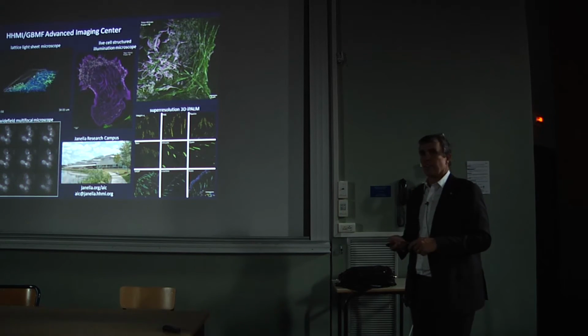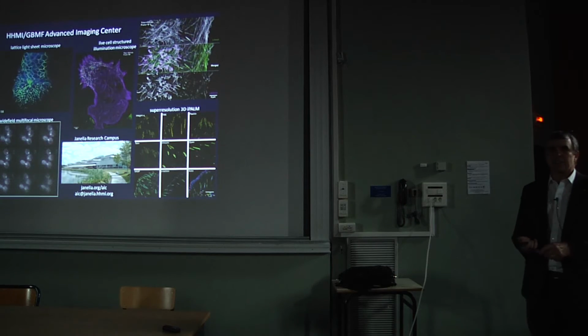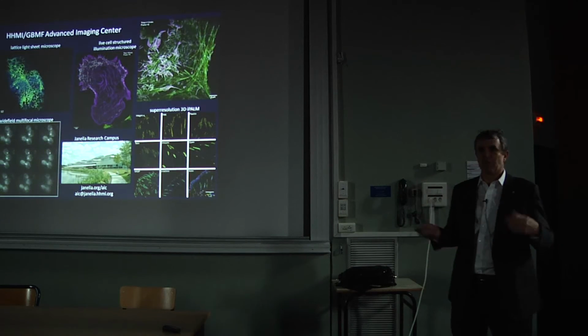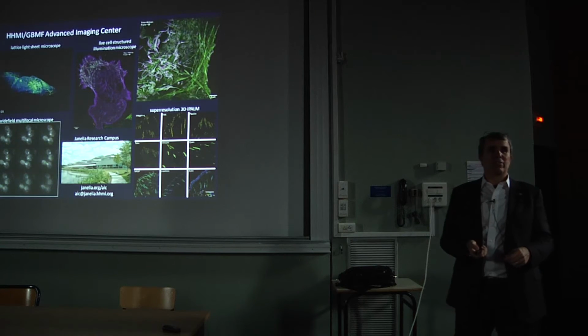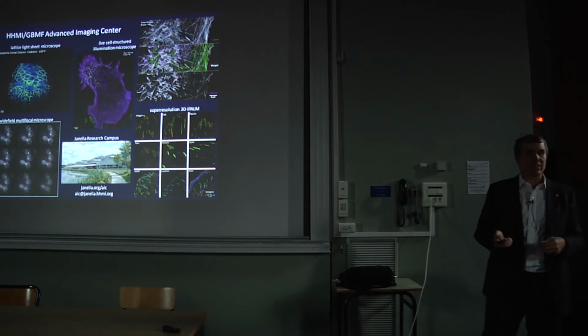The second is that for people who want to build these microscopes, we have complete documentation, everything down to the screws, the mechanical drawings, the wire diagrams, the control code, the analysis code, and so forth. You execute a research license and we give you what you need to build one yourself. But you need to be kind of physicist level, experimentalist savvy to put one of these things together.